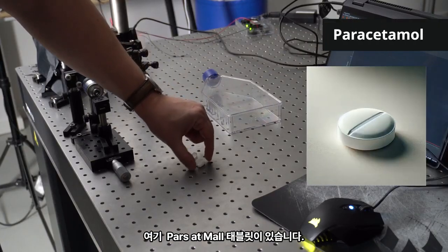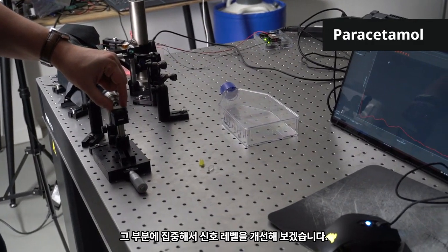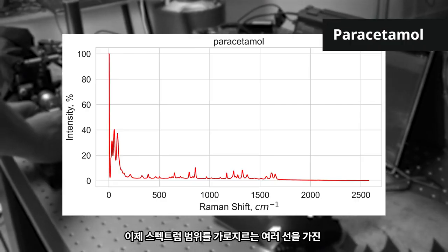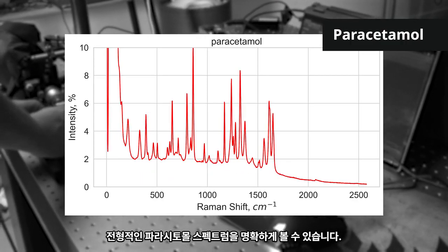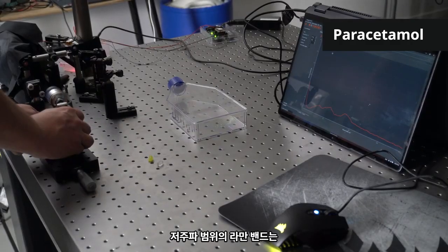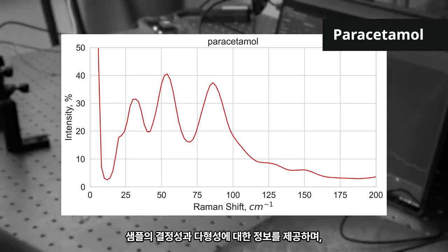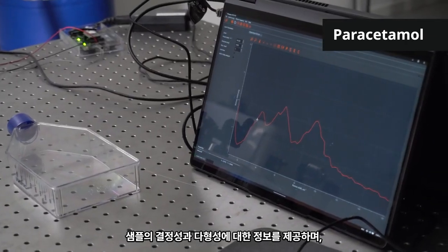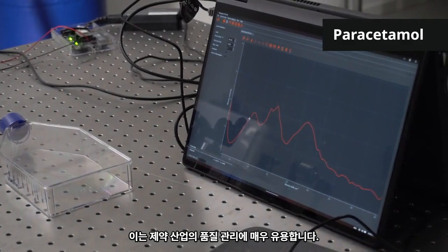Here's a paracetamol tablet. Let's focus on it and improve the signal level. Now we can clearly see a typical spectrum of paracetamol with multiple lines across the spectral range. The Raman bands in low-frequency range below 200 wave numbers provide the information on crystallinity and polymorphism of the sample, which is extremely valuable for the quality control in pharmaceutical industry.